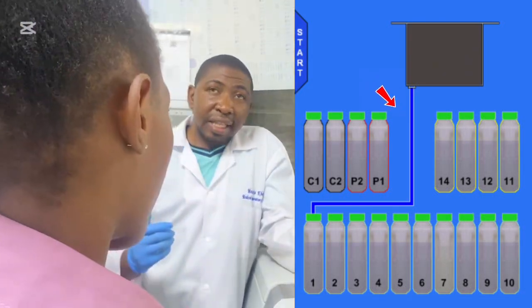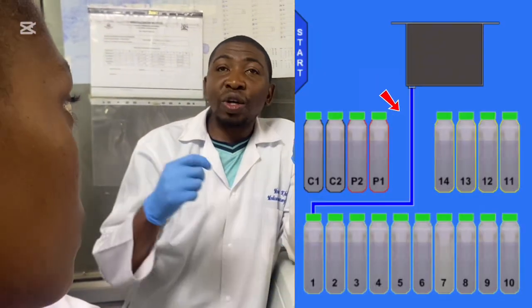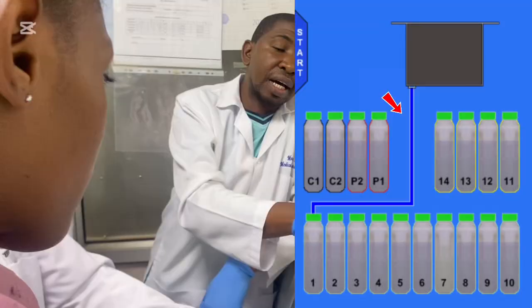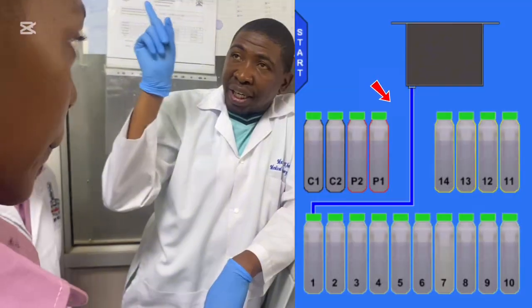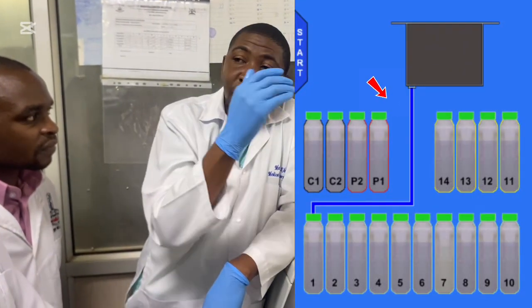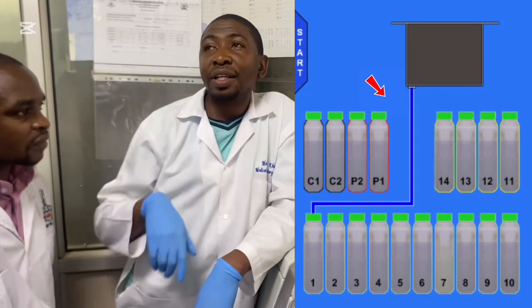That's why we call the closed system fluid transfer, because reagents are transferred from the reagent containers to the specimen processing chamber. Whereas in the open system, tissues or samples are transferred from one reagent container to another until the whole cycle is done.